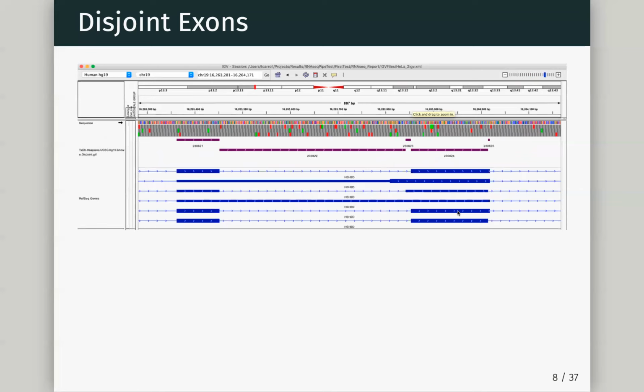We zoom in on what was going on in that part there. You can see it is kind of complex. And what it's trying to do is basically pull out for us an exon part, which allows us to represent every exon there. So we have an intron retention here. So this is when we have one long exon over this, what would be an intron in all the other versions of the transcript. And so that means we keep this exon, we gain an exon here, which represents most of this.